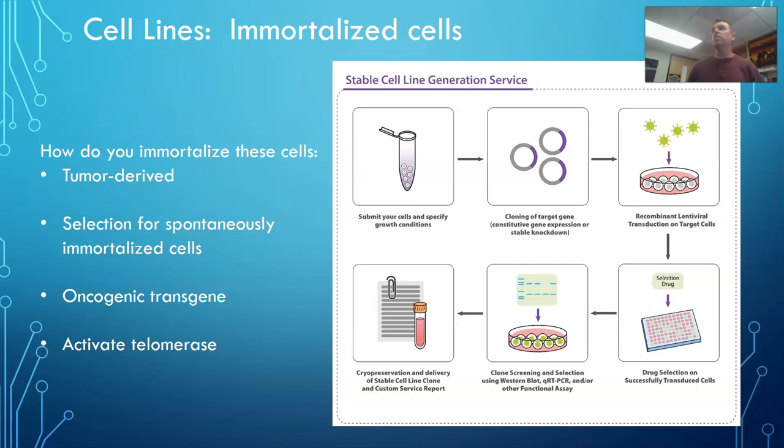A good example of this is, for us, we actually are studying HPV. So we're injecting an HPV oncogene into the cells and really seeing what other cell cycle machinery that affects. Why does it cause cancer? But when we try and just transiently transfect, just kind of add it to the cells, only about 10% of the cells actually get the gene inside it. And so if we look at those cells as a whole, we're actually studying 90% of the cells that aren't expressing that HPV gene that we want them to.